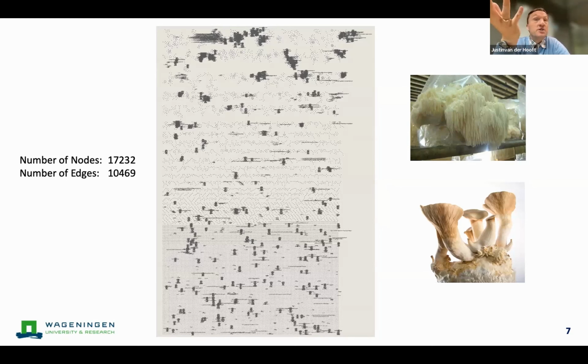So first of all, what we can see is that these library annotations are very concentrated in several families, and that kind of strengthens our hypothesis that we connect similar spectra, because if one spectrum has a match to the library, then it's also more likely that the neighboring spectra has a match to the library or even to the same library spectrum if the spectra are quite similar. This strengthens our belief that the molecular network is organizing the spectra as we want, and also hopefully that it connects chemically related metabolites based on the spectra. However, as you can hopefully agree, it's a lot of nodes.